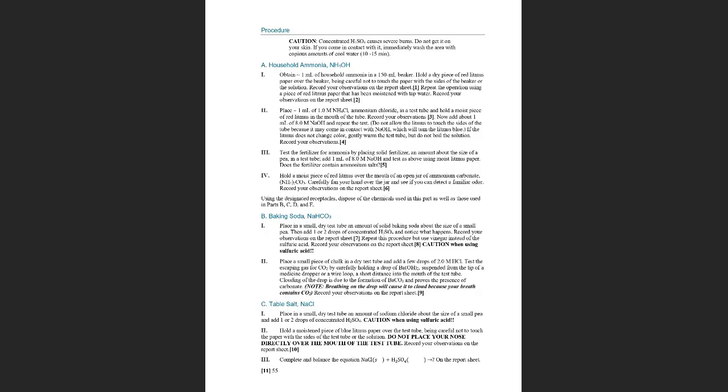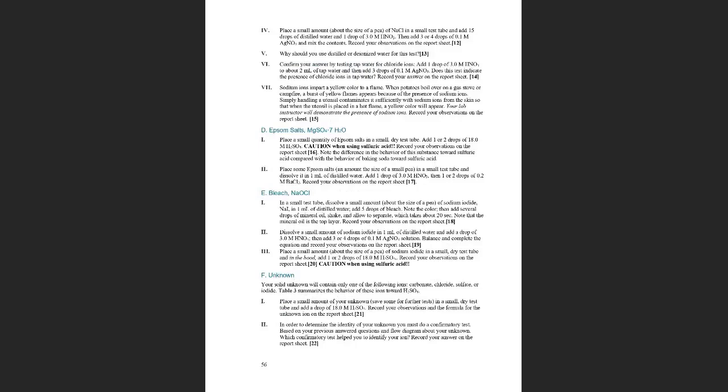How are you going to test ammonia? How are you testing baking soda? How are you testing table salt? How are you testing Epsom salts? And how are you testing bleach? And then the F is the unknown. So there are a bunch of reactions that you need to get familiar with, but it's not that bad. Any questions so far in this quick overview of the experiment?